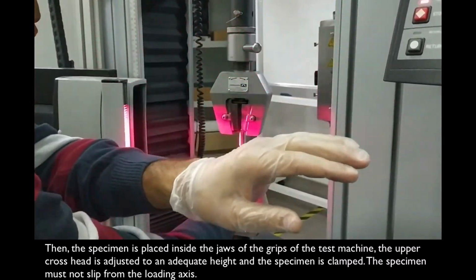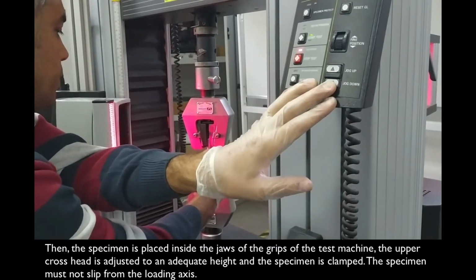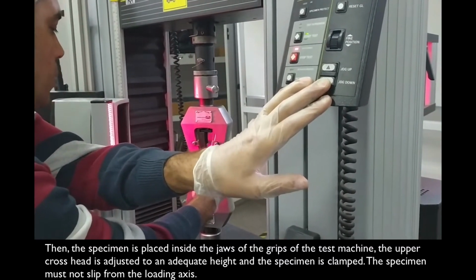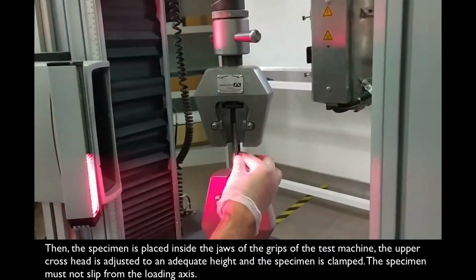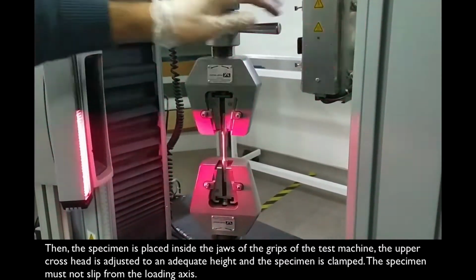Then, the specimen is placed inside the jaws of the grips of the test machine, the upper crosshead is adjusted to an adequate height, and the specimen is clamped. The specimen must not slip from the loading axis.